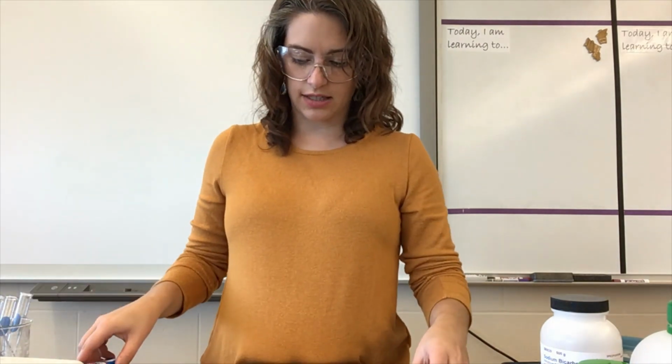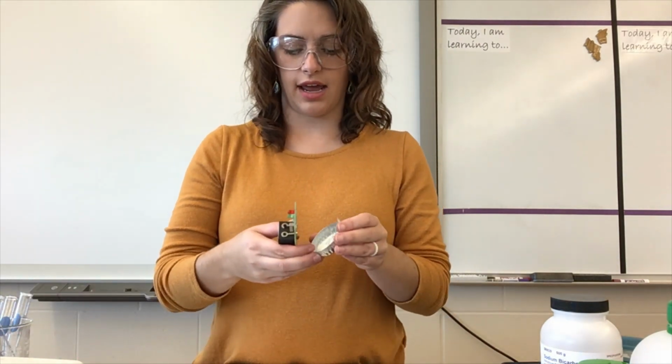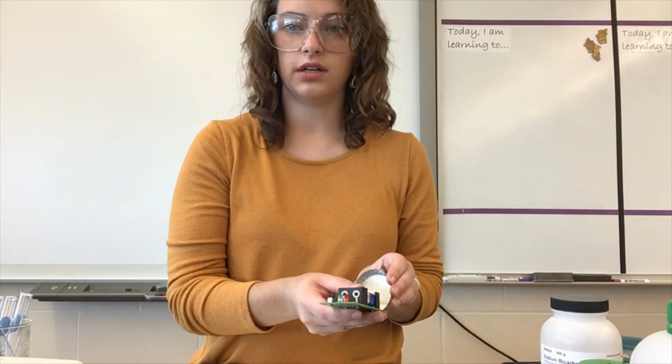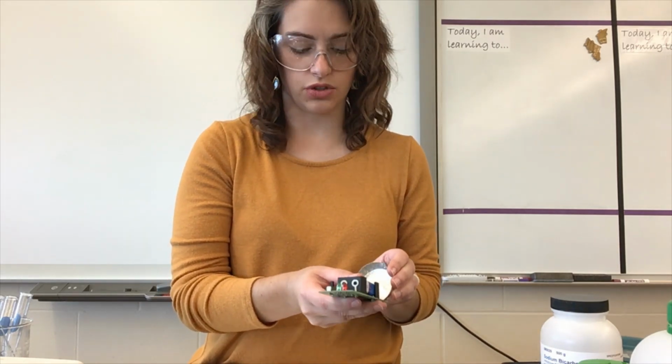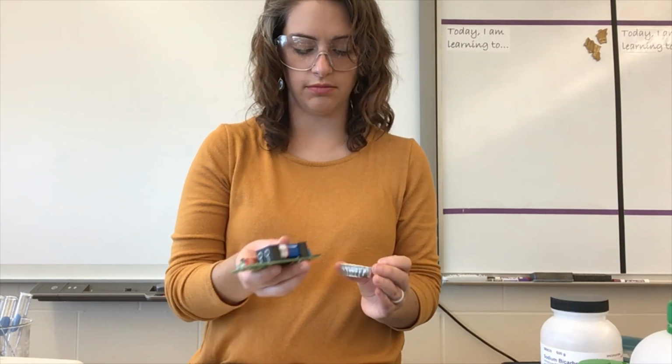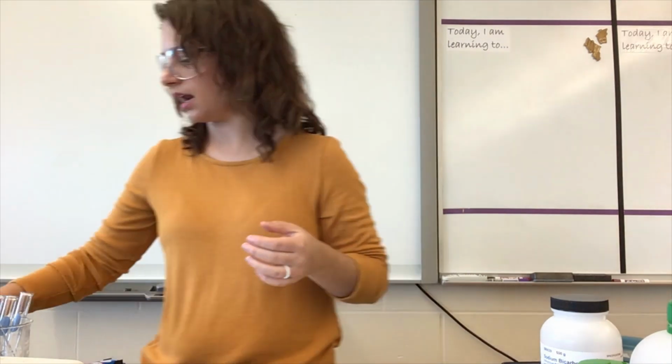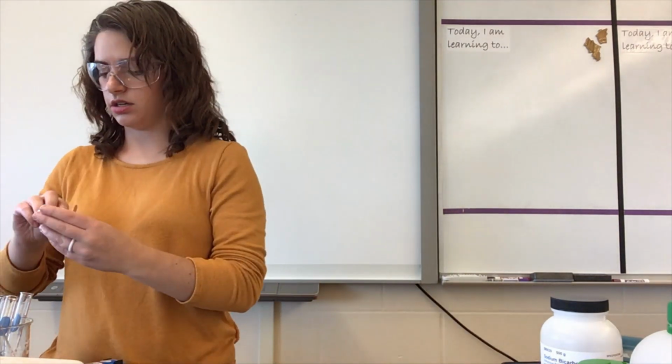Okay, let's test some conductivity. So conductivity as a solid is a definite no. There's no light coming on when we put it in the solid. So let's test it as a solution.